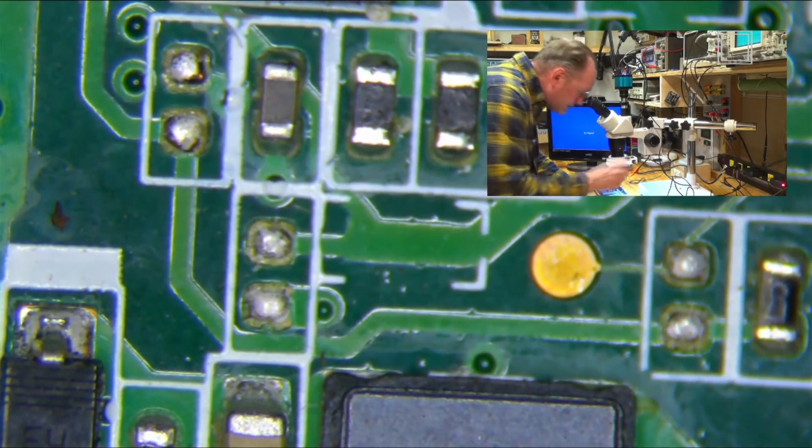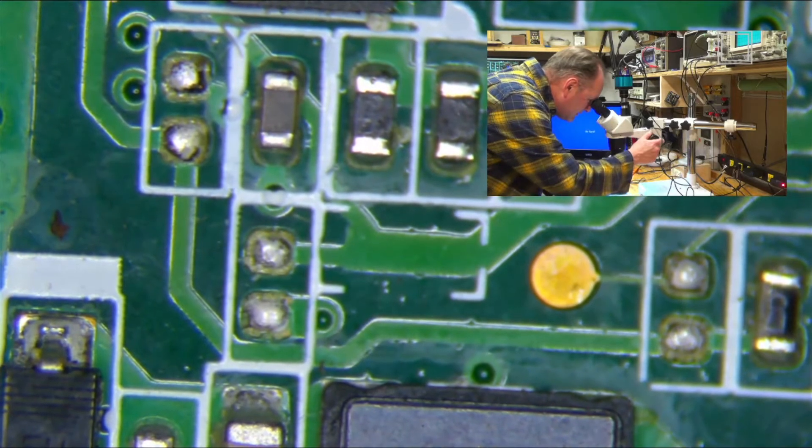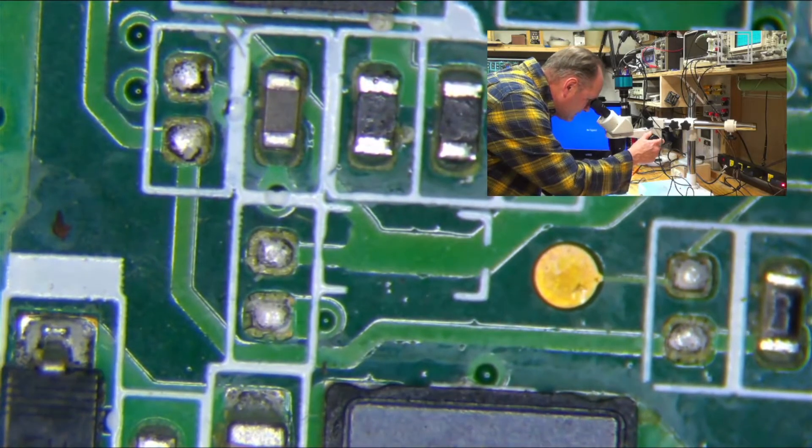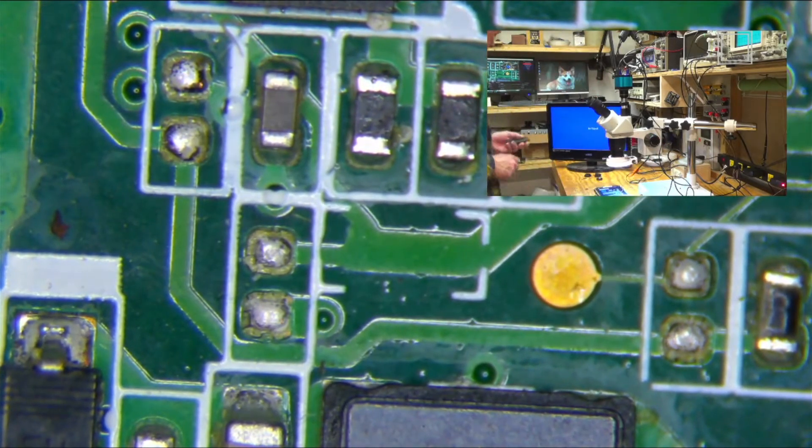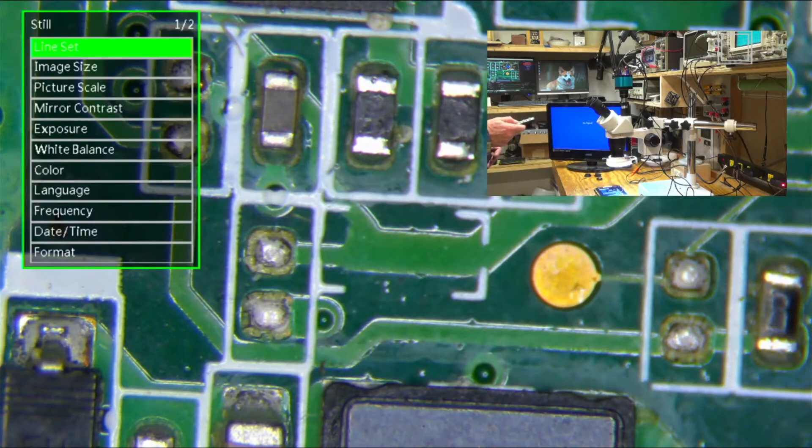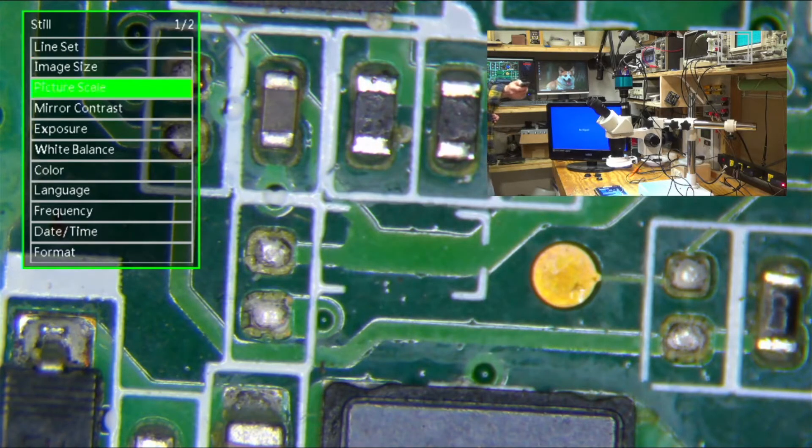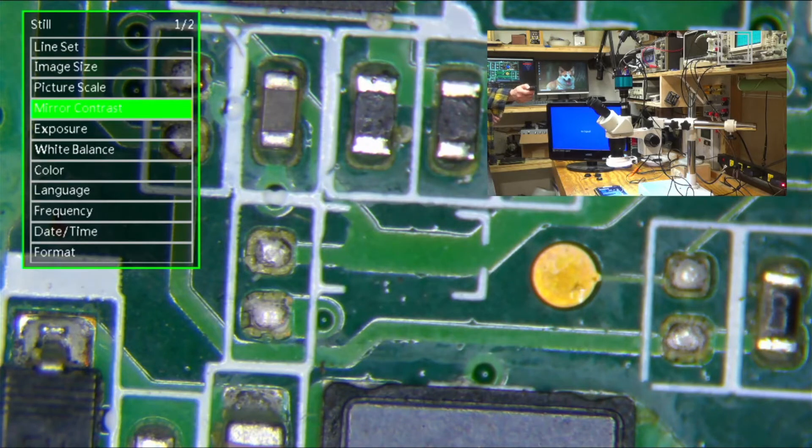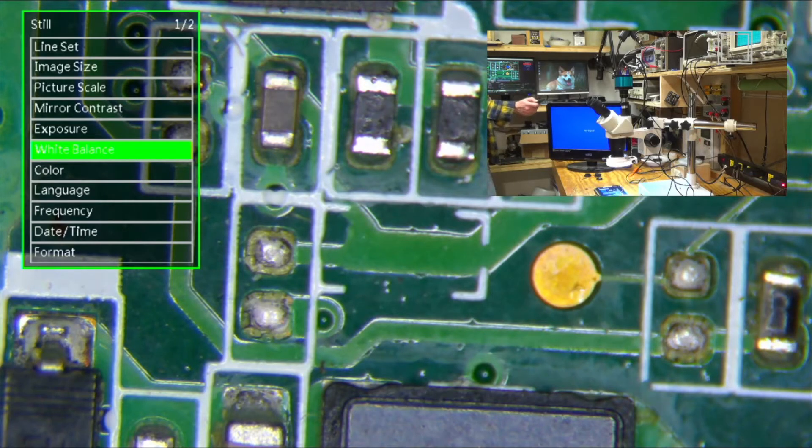Oops, I got my reading glasses on. Yeah, so I'm happy with the resolution. And you've also got, like, this camera comes with a remote, and it's too far away for me to read. You've got a number of different settings for, you know, like white balance.